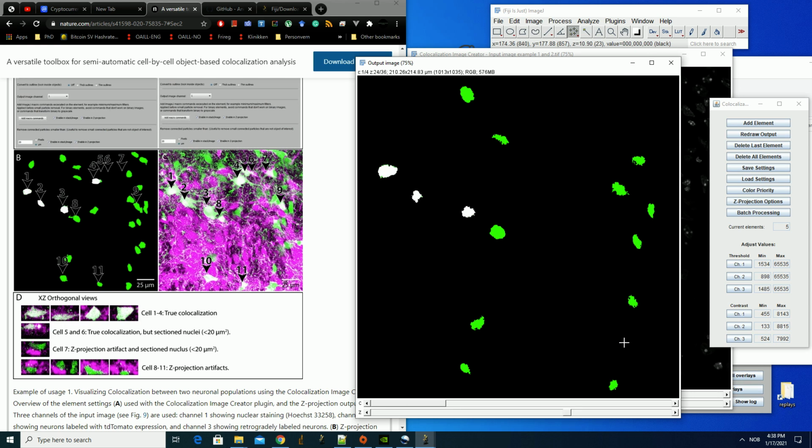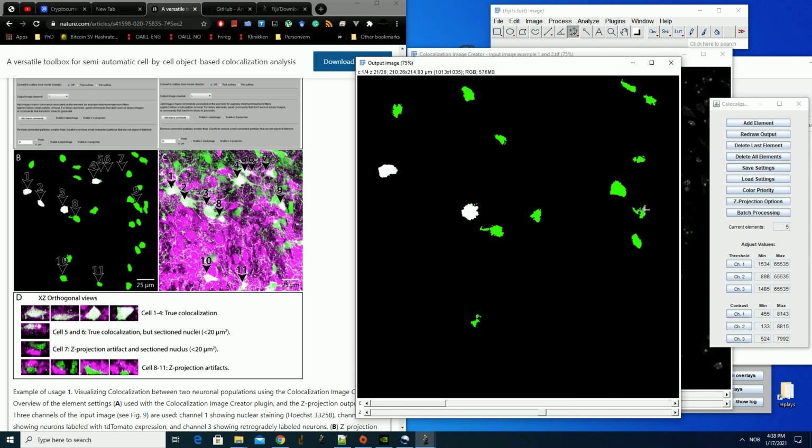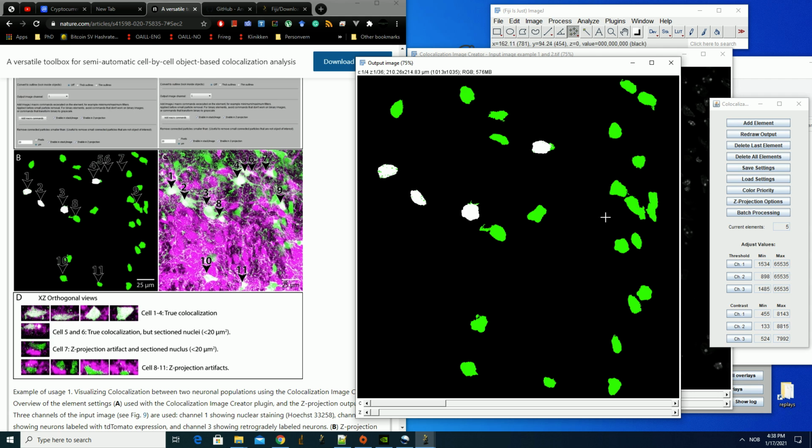and that provides a better separation and easier identification of individual cells. And I recommend that if you see some weird shaped nuclei like this, and if you're extremely concerned about the accuracy of your total number of cells and not only the degree of what the colocalization categories exist, that you can go into the set stack and have a look, and also look in the verification channels and see what's actually going on, and you can use that when you count your cells in the second plugin.